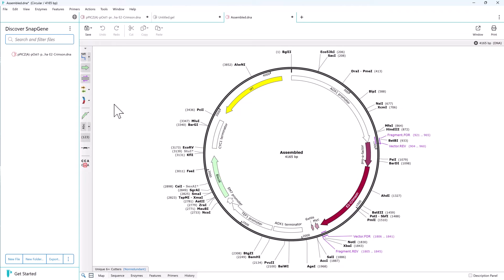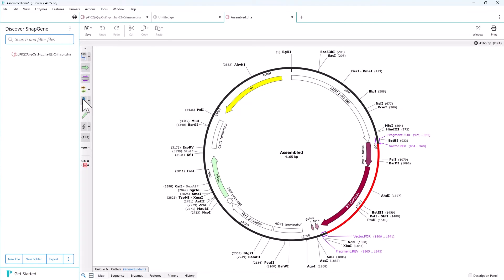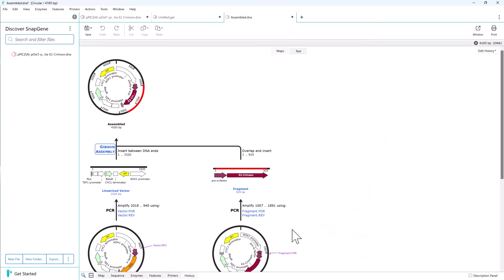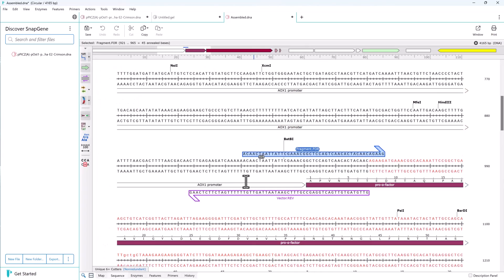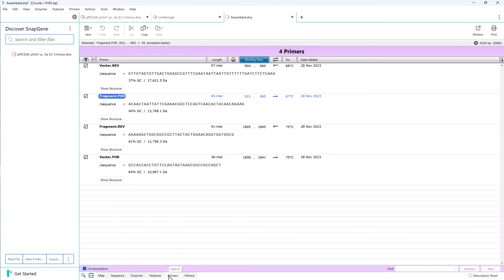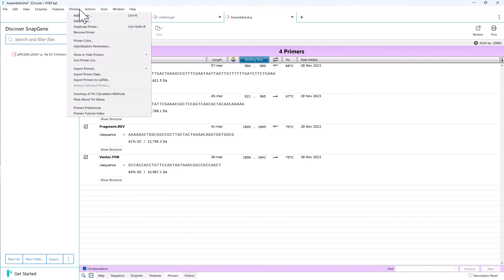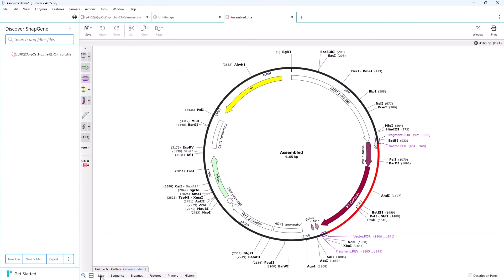We can turn on the history coloring to see the assembled fragments. In history view we can see the steps we have simulated. The new primers are annotated on the sequence and a list of primers is in the primers view. From here we can export the primers and order them.